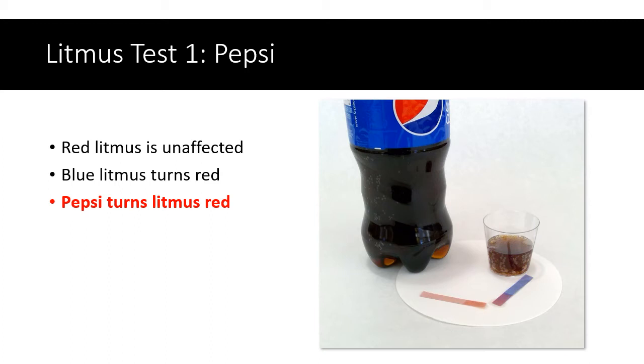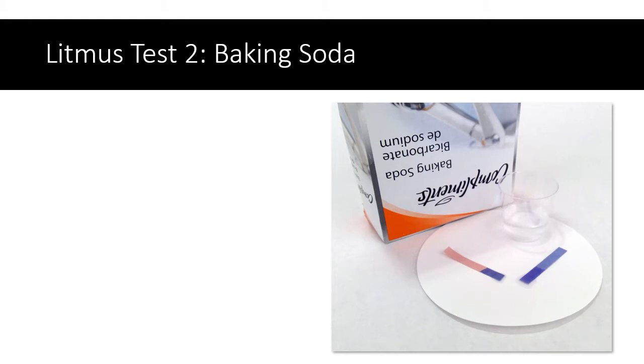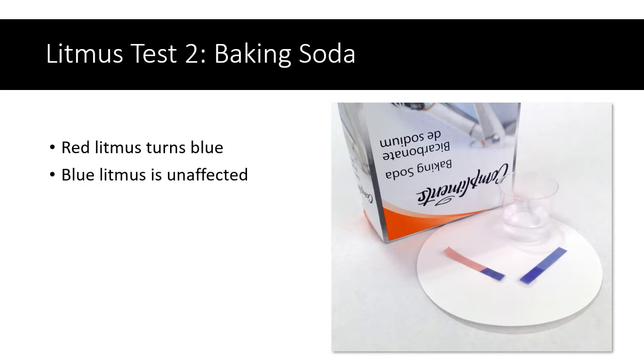Let's test another substance. This is a sample of baking soda mixed in with some water. Once again I've dipped two strips of litmus paper in, and you can see that the red litmus turned blue, while the blue litmus was unaffected — it stayed blue. Baking soda is a substance which turns litmus blue.